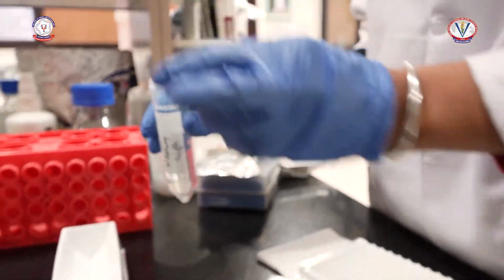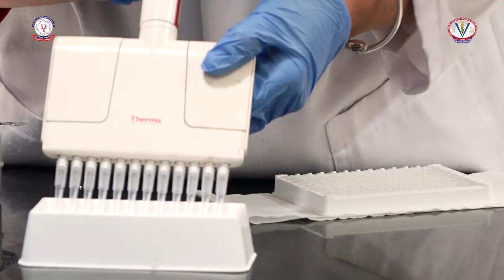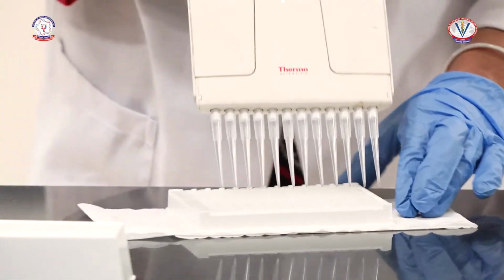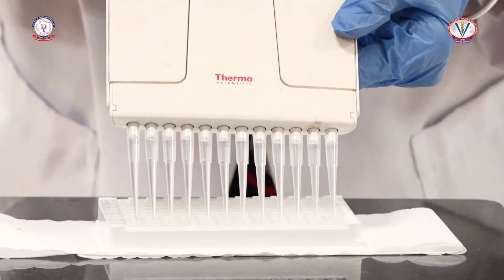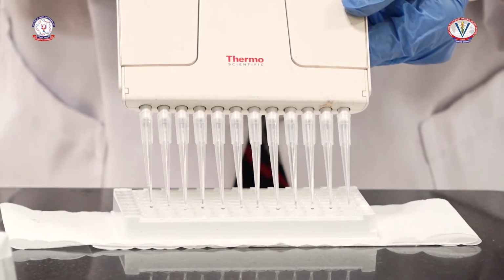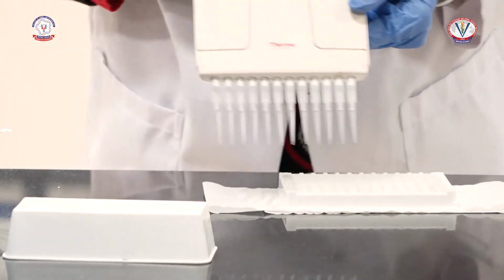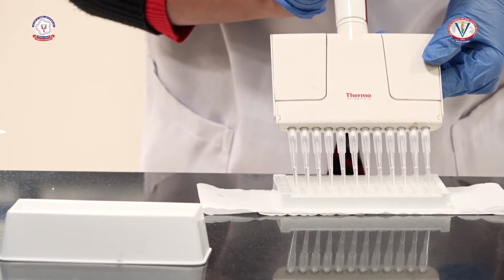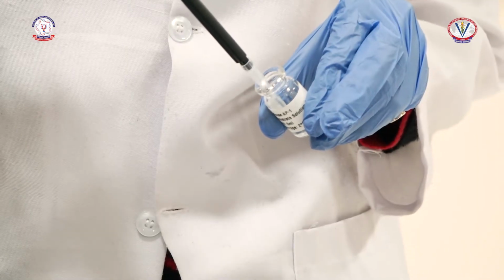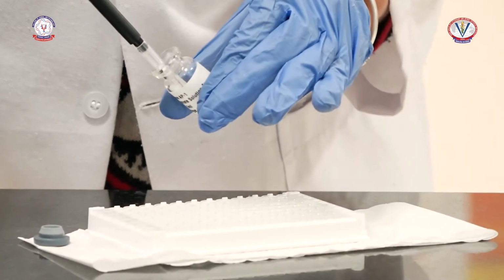After the incubation of 1 hour, the plate is washed with the washing buffer. And then 50 microliter of TMB substrate is added to each well.